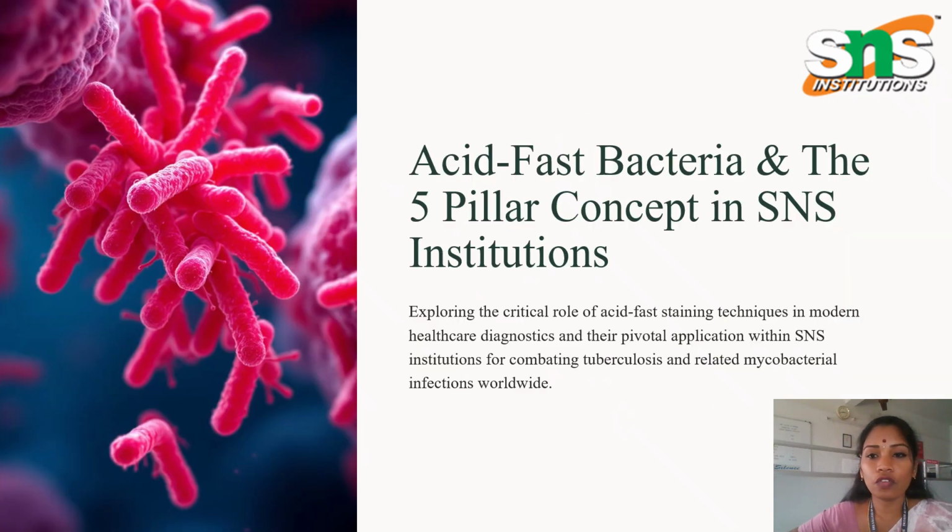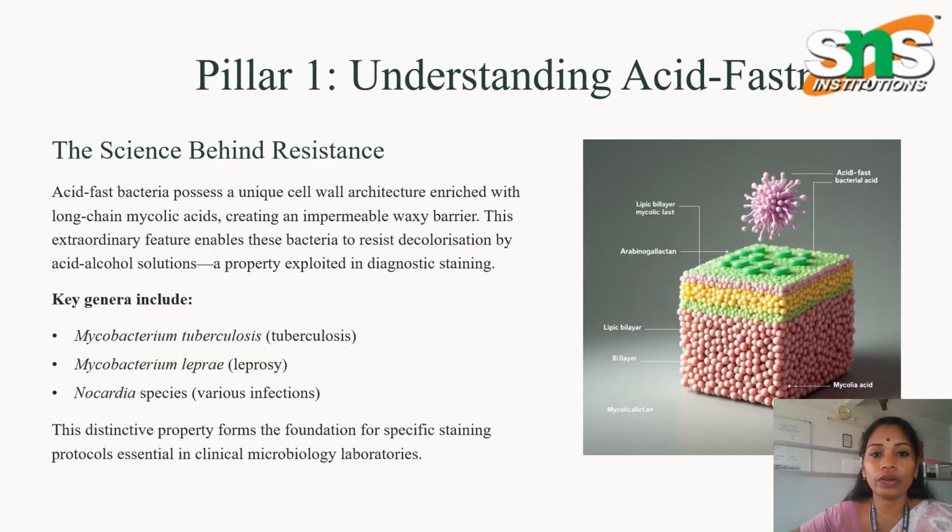Moving on to acid-fast bacteria with 5 pillars, exploring the critical role of acid-fast techniques in modern healthcare diagnosis, their pivotal applications at the SNS institution, and mycobacterial infection worldwide. Let's begin with the first pillar.